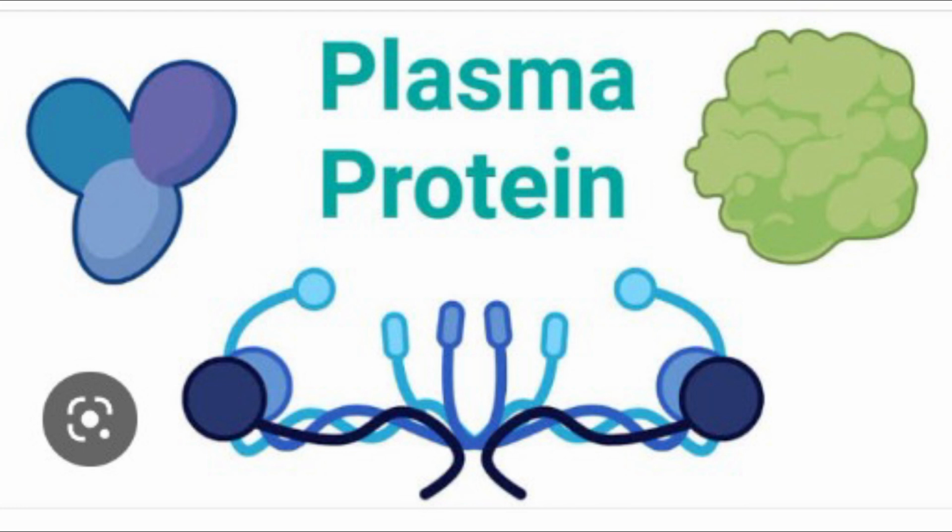Test for hemoglobin. Principle: heme protein reacts with benzidine in the presence of H2O2, forming a colored product. Heme of the hemoglobin decomposes H2O2. The liberation of oxygen oxidizes benzidine to a green color, which is unstable.